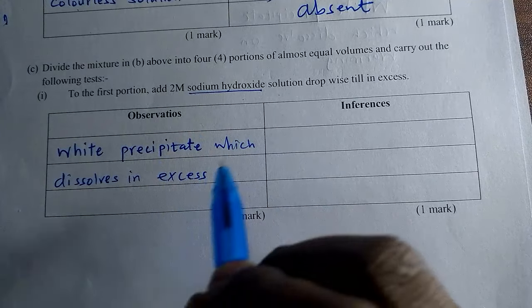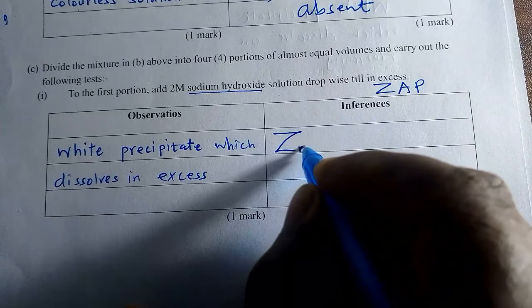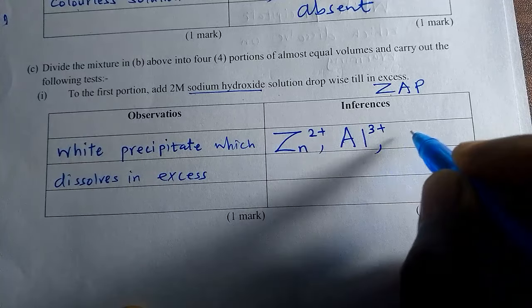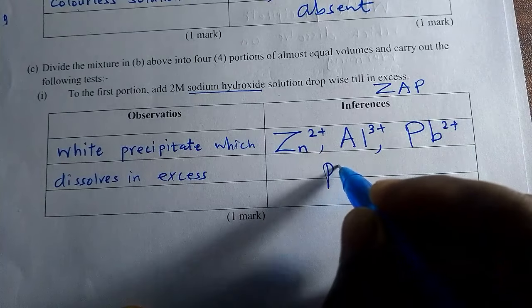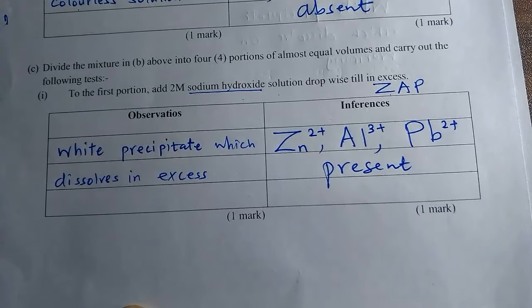It means ZAP is present. ZAP stands for zinc, aluminum, and lead. These are the amphoteric ions, present.